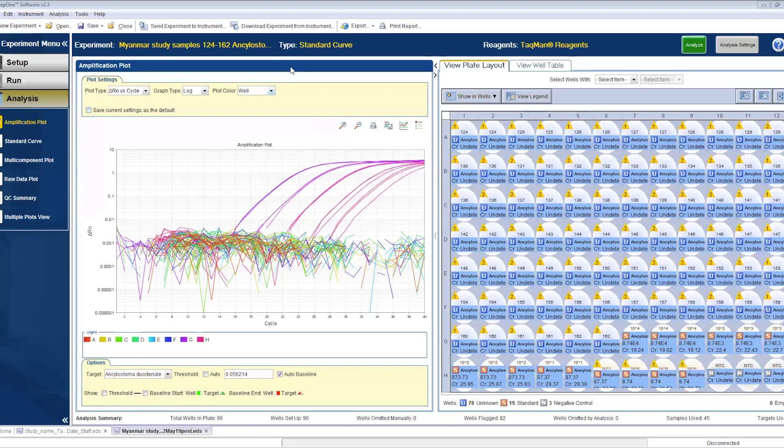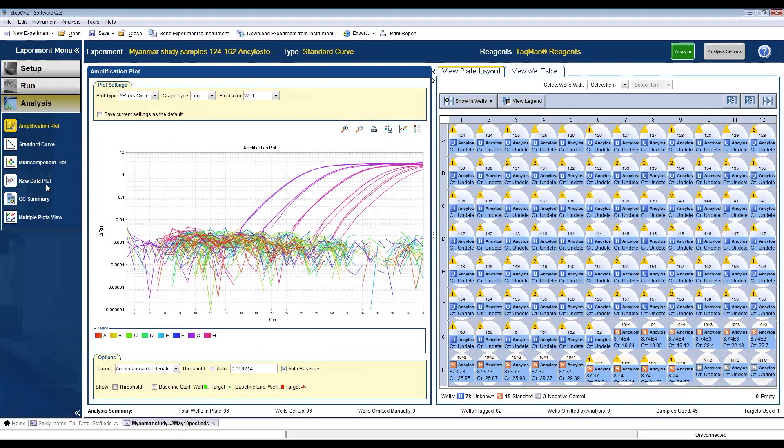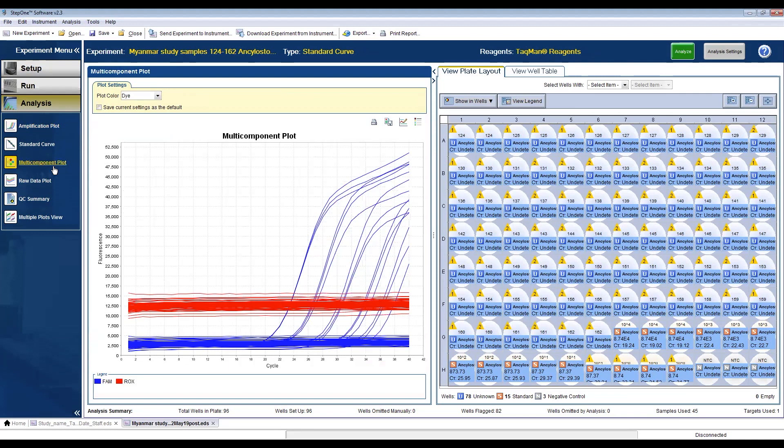Now I'm going to show you the results from an older run. From the analysis tab, you can check the amplification plot, the standard curve, the multi-component plot, and the QC summary.